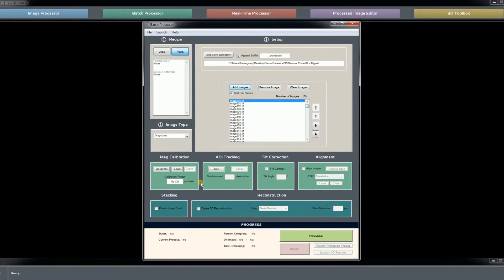We do not need to do any magnification calibration because this is just an image stack creation — we will do that for the 3D reconstruction side. This is a dual beam FIB dataset where we do need to tilt correct the images because they were acquired at an incident angle of 52 instead of 90. We do need to align the images, and we are going to use basic translation for the alignment. We don't have any predetermined alignments. Finally, we will create an image stack, so we will click process.